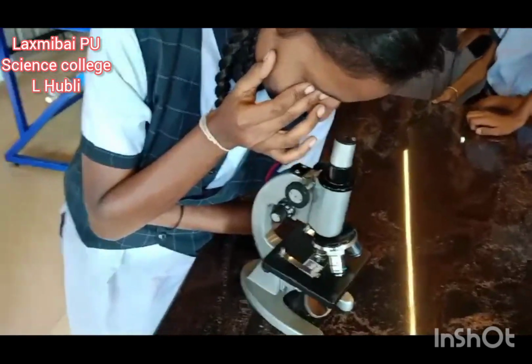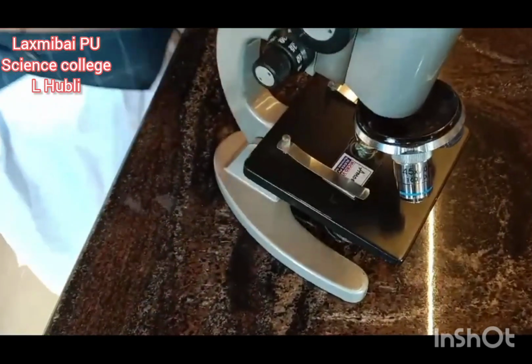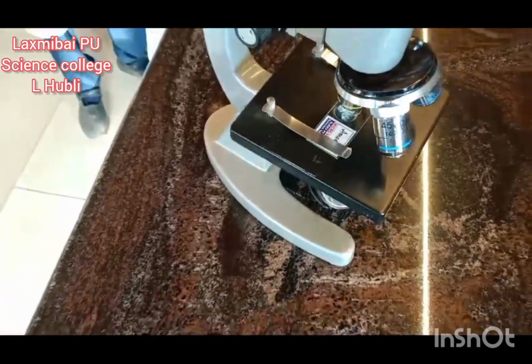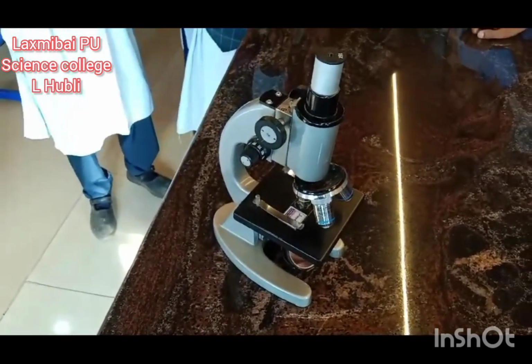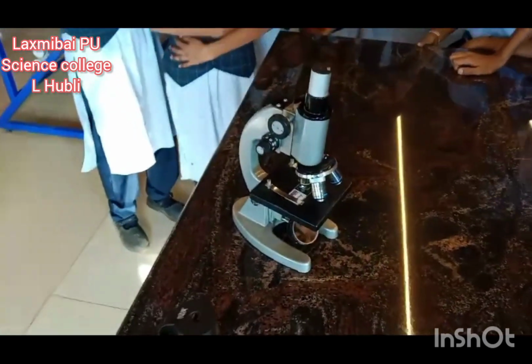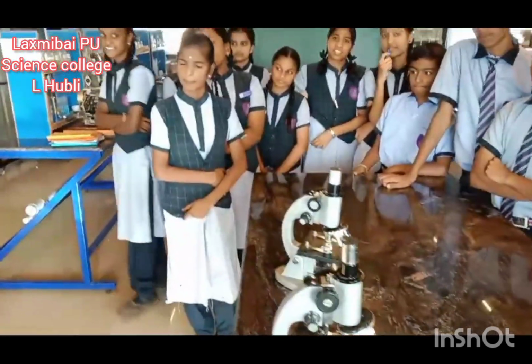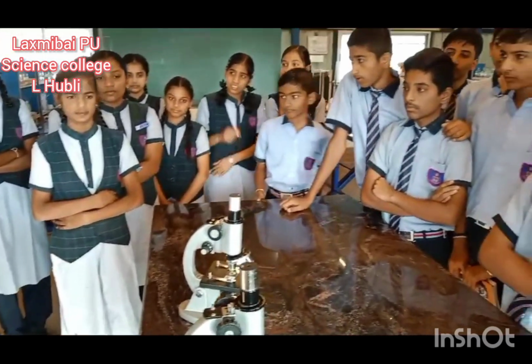The first slide you are observing is amoeba. What is the structure of amoeba? Irregular in shape, right? Which shape can you see this? Irregular shape. Now, how is the shape here? It's elongated. Did you see? It's elongated, long one. Next, you can see yeast here.